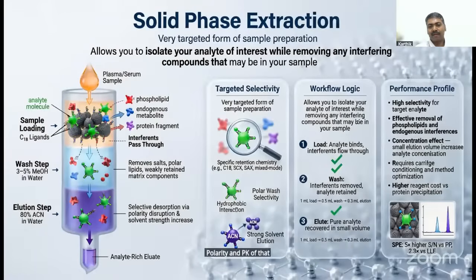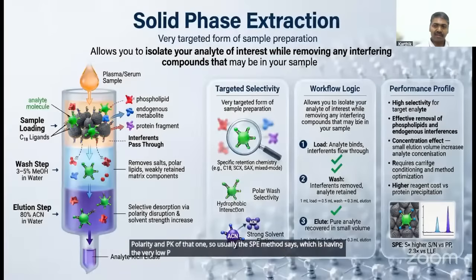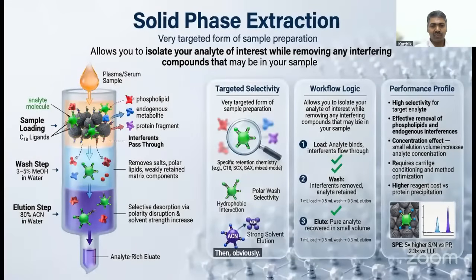The choice is based upon the compound, its polarity and pKa. Usually, for drugs having a very low pKa value, or a negative pKa, you have to go with solid phase extraction. And if, in liquid extraction or protein precipitation, we get matrix ion suppression or enhancement, then obviously we have to switch to solid phase extraction.